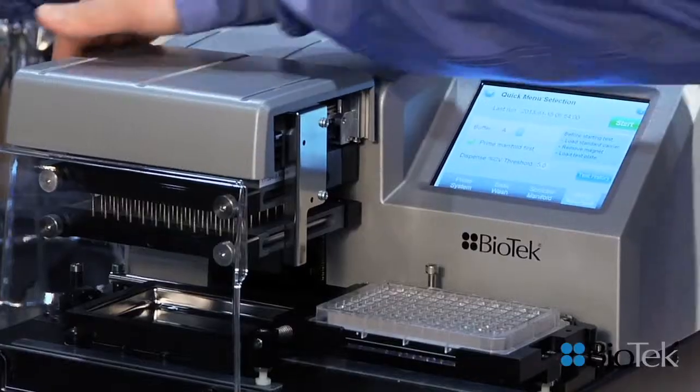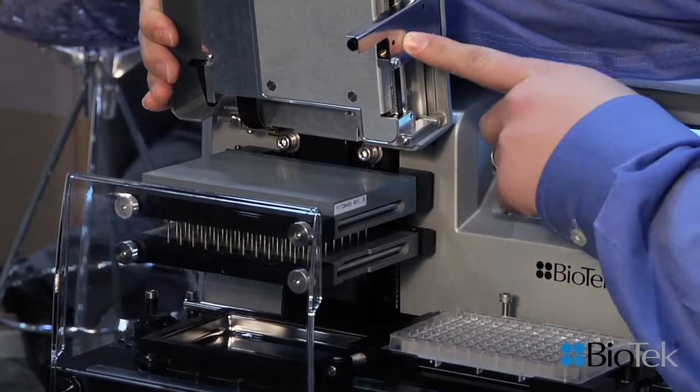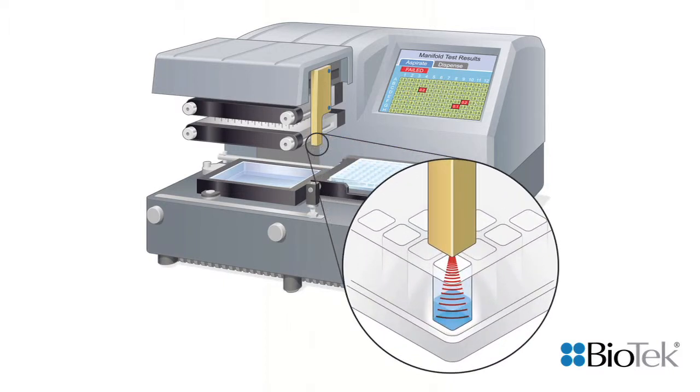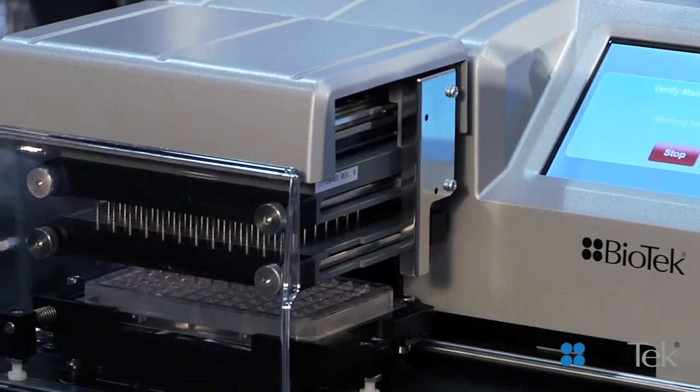There's a new module that's been added on top of the wash manifold here, and it houses a contact-free liquid level sensor. When it runs, that sensor acoustically detects the level of liquids in the wash after each aspirate and dispense step in the microplate, and that's how it detects the clogs.